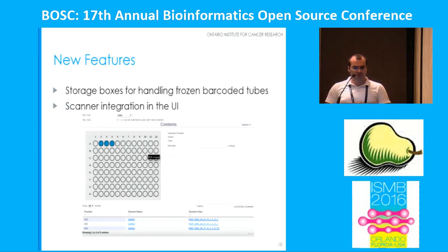We also needed to track what was in the freezer. So we created a storage box interface. Earlham has a feature in MISO called plates, which are meant for tracking liquid handling robot plates, like 96-well plates with samples in them. The fundamental difference between what we're doing in the freezer and the plates is that the plates are a one-step thing. If you create this plate, your liquid handling robot deals with it, and then that's it.